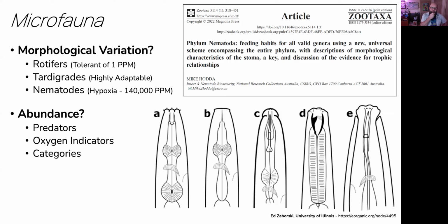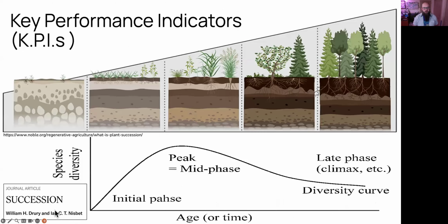So, of course, as multicellular organisms, tardigrades and nematodes tend to need some oxygen because of their respiration. And so, again, I'm looking for them in there. When I put my worm compost on a slide for the first time and saw it crawling with a bunch of different tardigrades, I got really excited because A, they're very cute, but B, they're a highly adaptable organism that I expect, if you give it space, will be able to fill a lot of different microbial niches or microorganism niches.